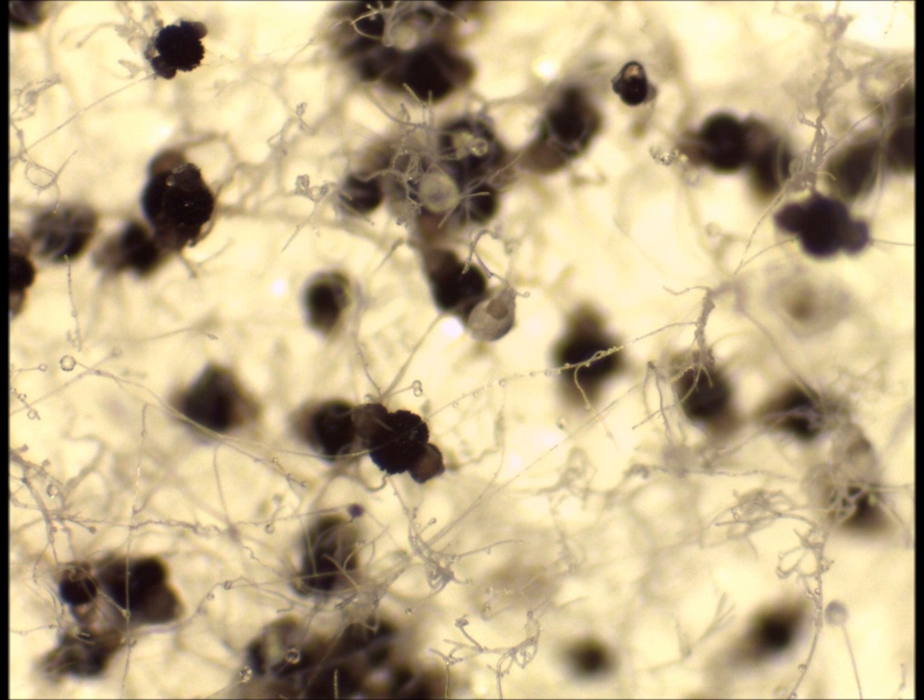So use the stereo microscope to have a good look at the plate, probably starting at low magnification, and make sure that you can identify the two different types. Remember that you can use the focus to change the focal plane and to move from looking at the spores close to the surface of the agar to those that are further from the surface.